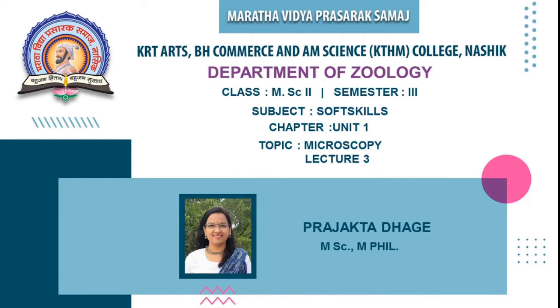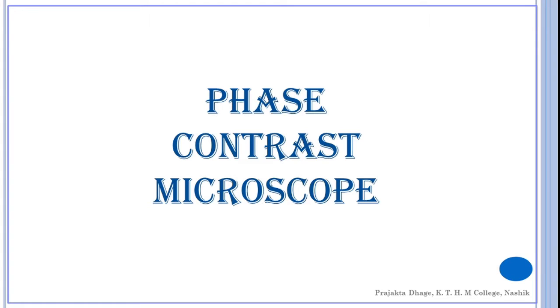Today I will be taking a lecture for MSc Part 2. The subject is soft skill and the chapter is Unit 1. Topic is microscopy and this is the third lecture of the series. So today I will be talking about the phase contrast microscope.